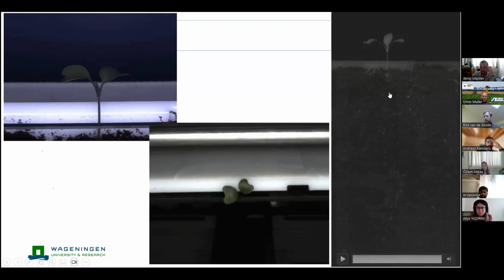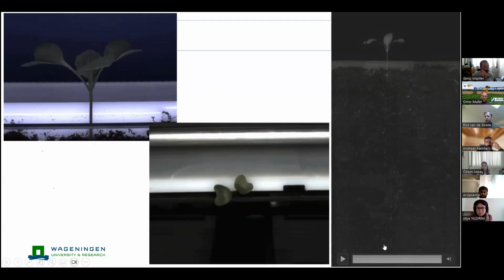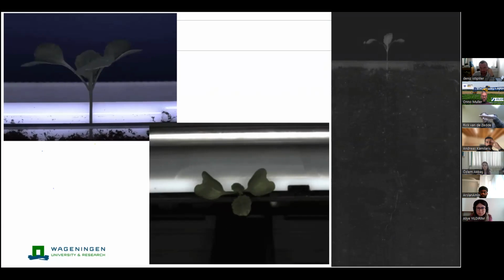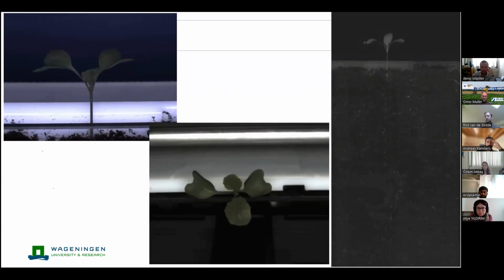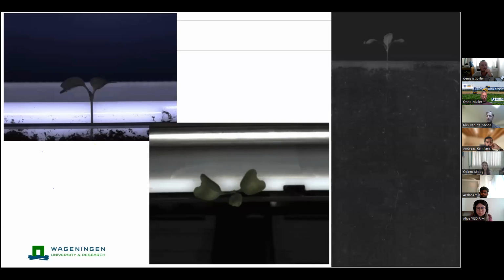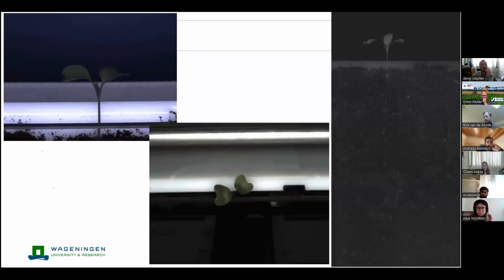And then it's of course a matter of keeping track of the root system with image analysis, figuring out how fast and how deep it is growing, how many roots it is forming, and how does this specific plant compare to its competitors or its brothers and sisters.